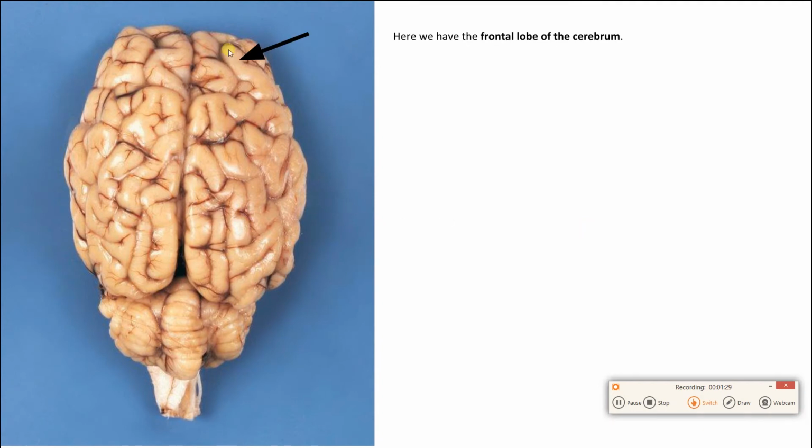We do see the frontal lobe right here. That's the frontal lobe of the sheep, where it does all of its thinking, where it has its sense of humor, its personality. I don't know how much of a sense of humor or a personality a sheep would have. But there's the frontal lobe. We'll go back a little bit. We are in the parietal lobe here. Sense of touch, body awareness, of course, is one of the big jobs of the parietal lobe.